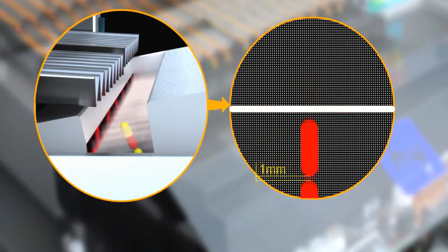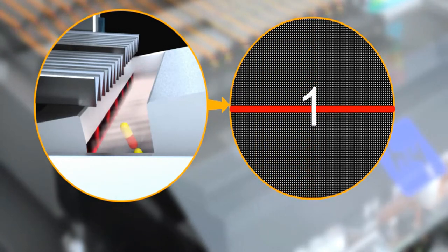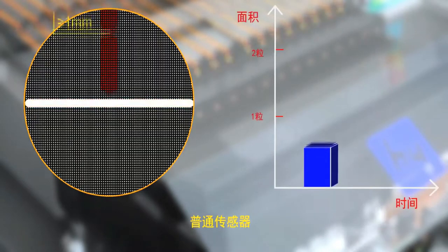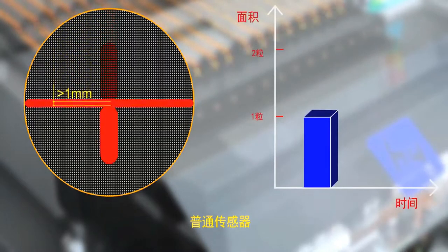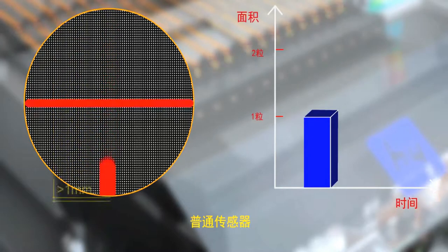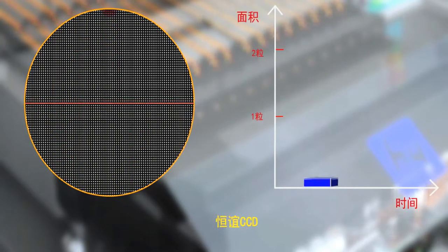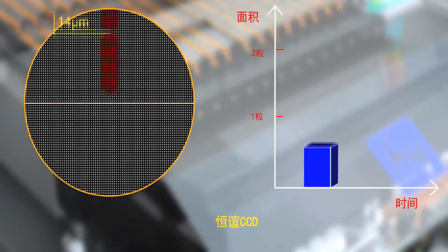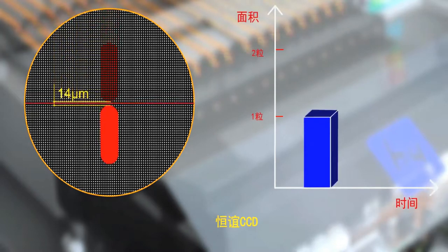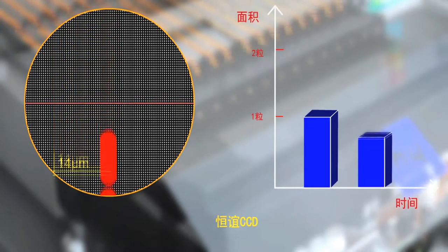Compare the two equipments when the following three situations happen. First, when two tablets enter the sensing area with distance less than 1 mm, the counting of the common counting machine is 1, and the counting through CCD technology of Heng Yi equipment is 2.